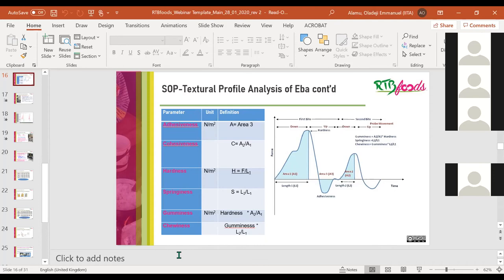Thank you. I think you are evaluating adhesiveness, and adhesiveness is not stretchability. We need to develop a different probe. You need to cut the mesh to evaluate stretchability, but we will discuss after. Okay, stretchability is important for the dough. Yes, it's very important. We know that. Bolanle, you want to react directly? I see your hand.